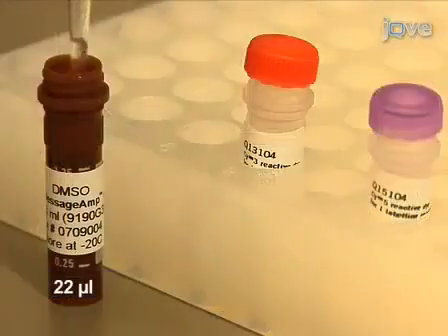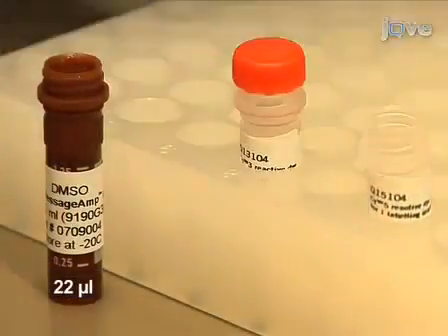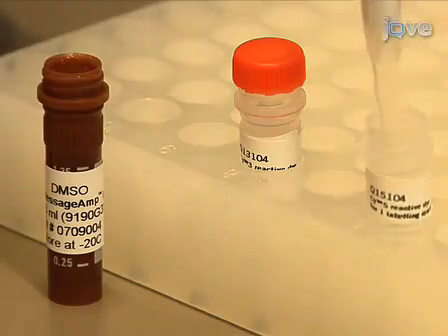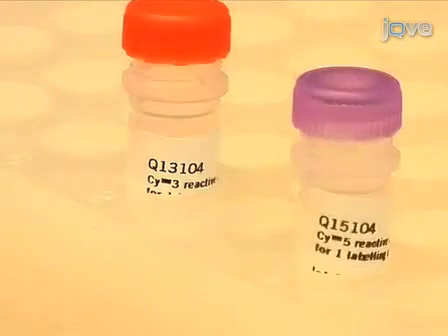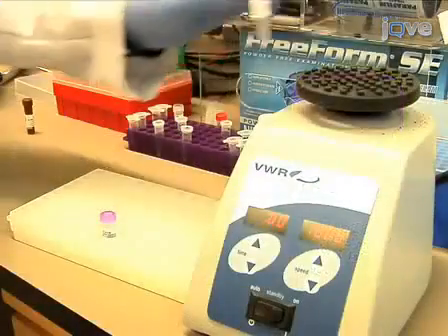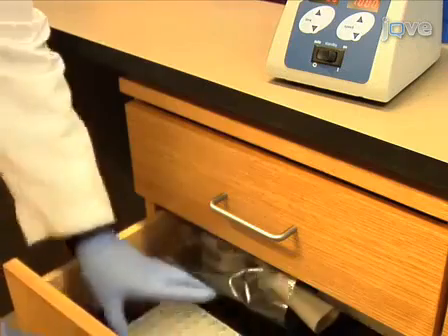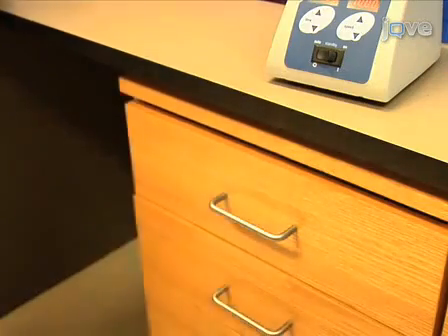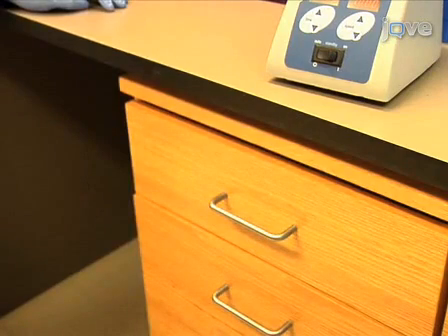Next, add 22 microliters of high quality DMSO to each tube of Psi-3 or Psi-5 dye. One tube of dye is enough for two samples. The Psi-3 dye is for labeling your reference samples and the Psi-5 dye is for labeling your test samples. Vortex the dyes to mix thoroughly. Remember to keep the dyes in the dark until ready to use, and do not prepare the dye earlier than one hour before using. Make sure no water gets in the dye DMSO mix at any point.